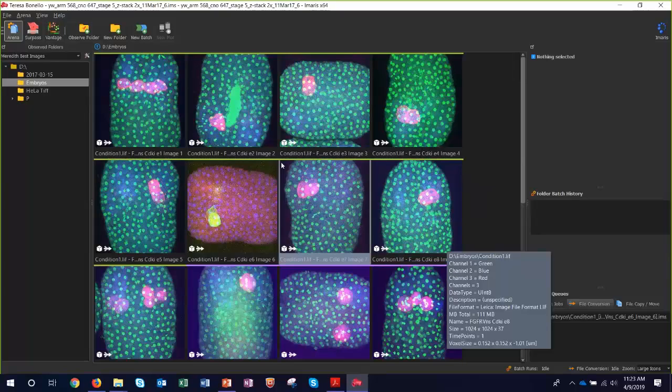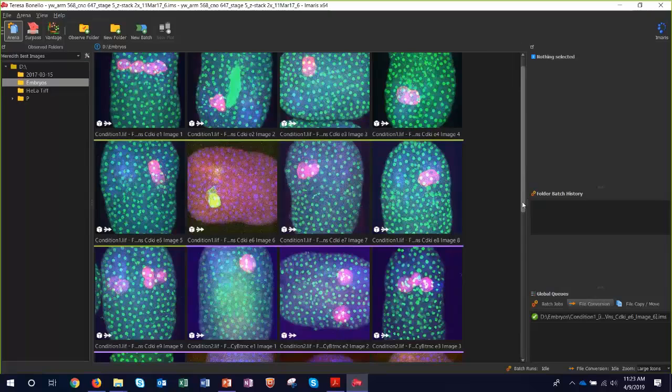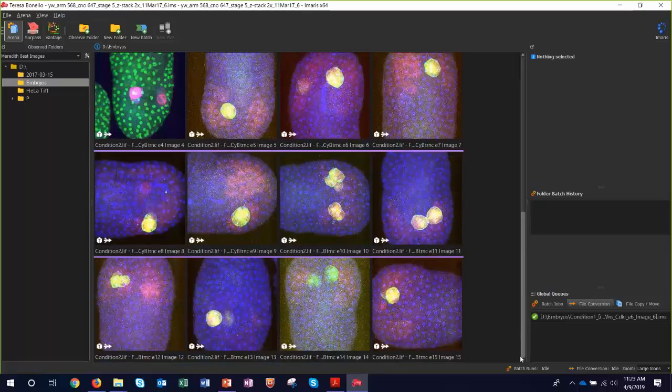So some of you may notice already that there's a colored bar that's running across the top of the first 9 images, and so it's like a greenish yellow. It's randomly chosen, so it will be different for the different images you have. And then we have a purple bar going over the rest of them. And so it's a nice way of just very quickly knowing which images go along with which file or which experiment, that sort of thing. So that's there for you.